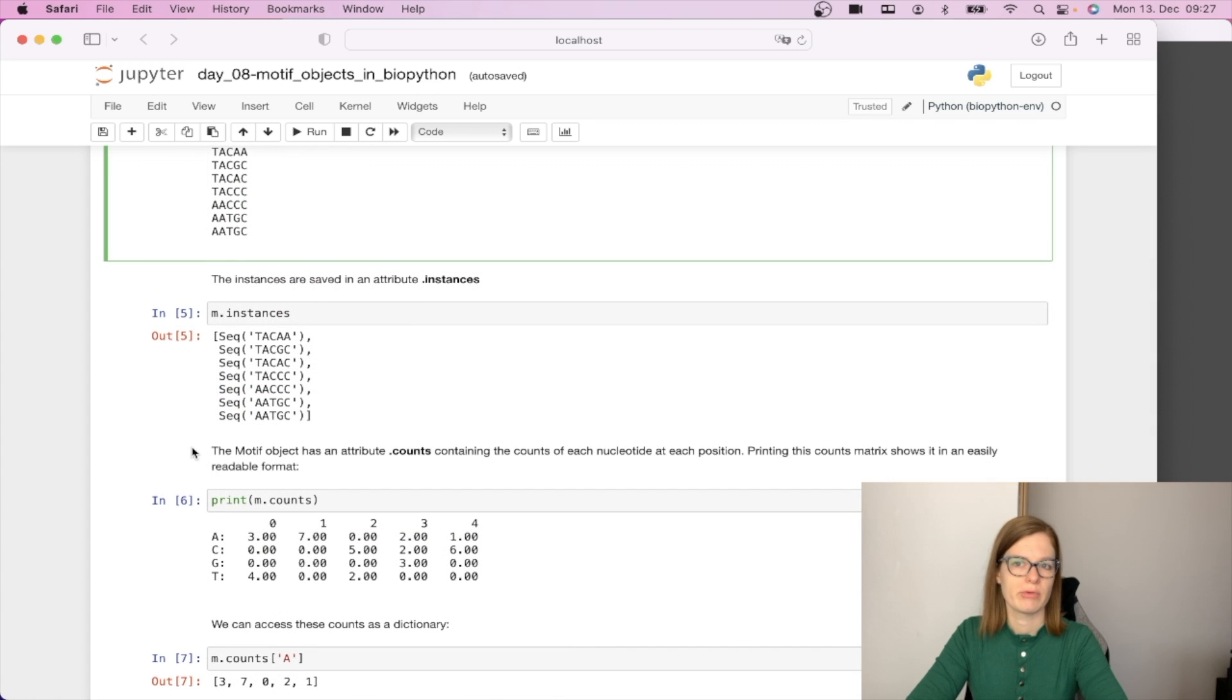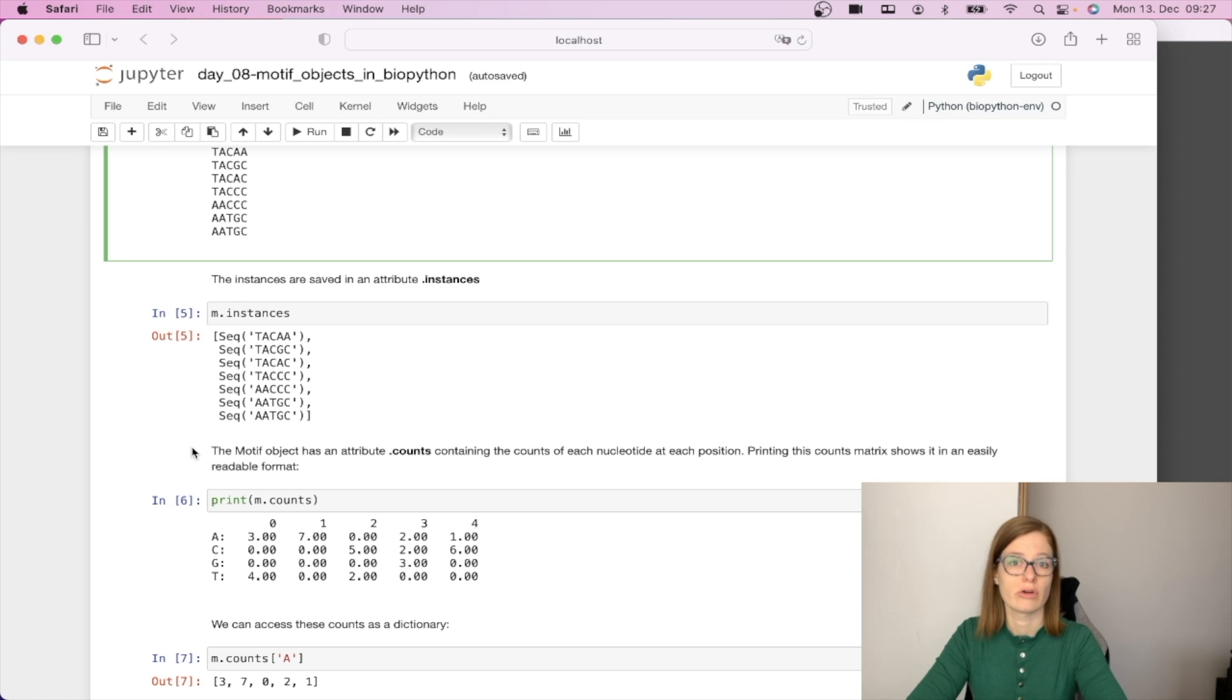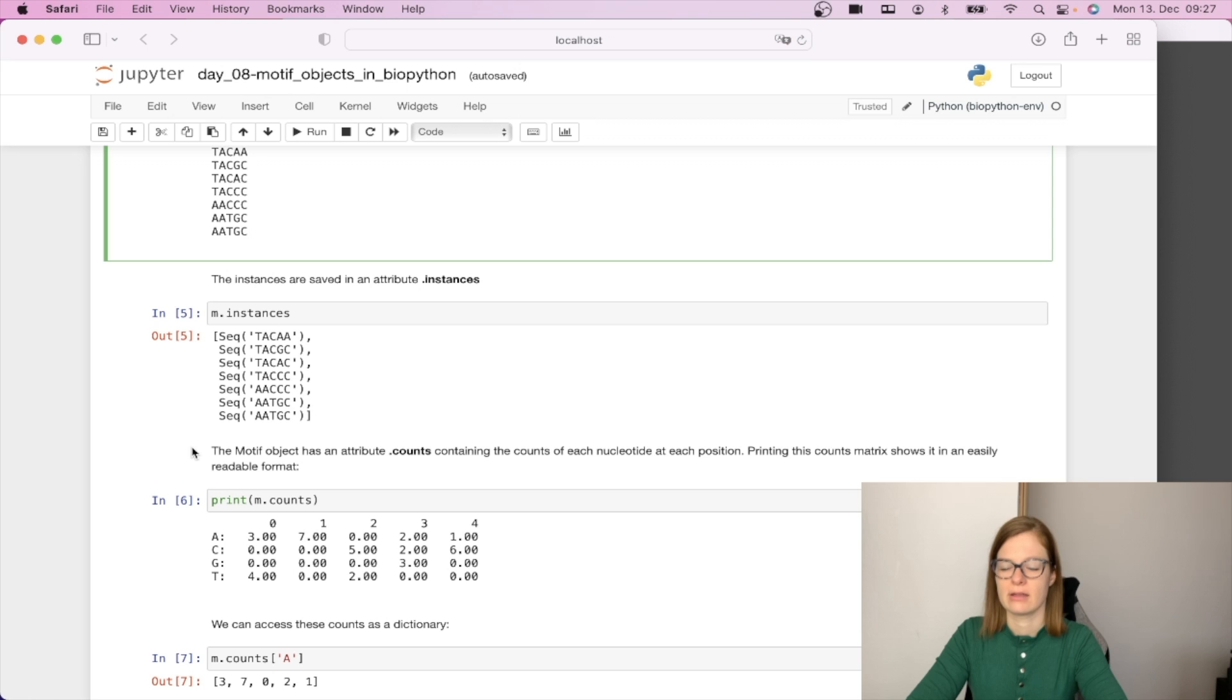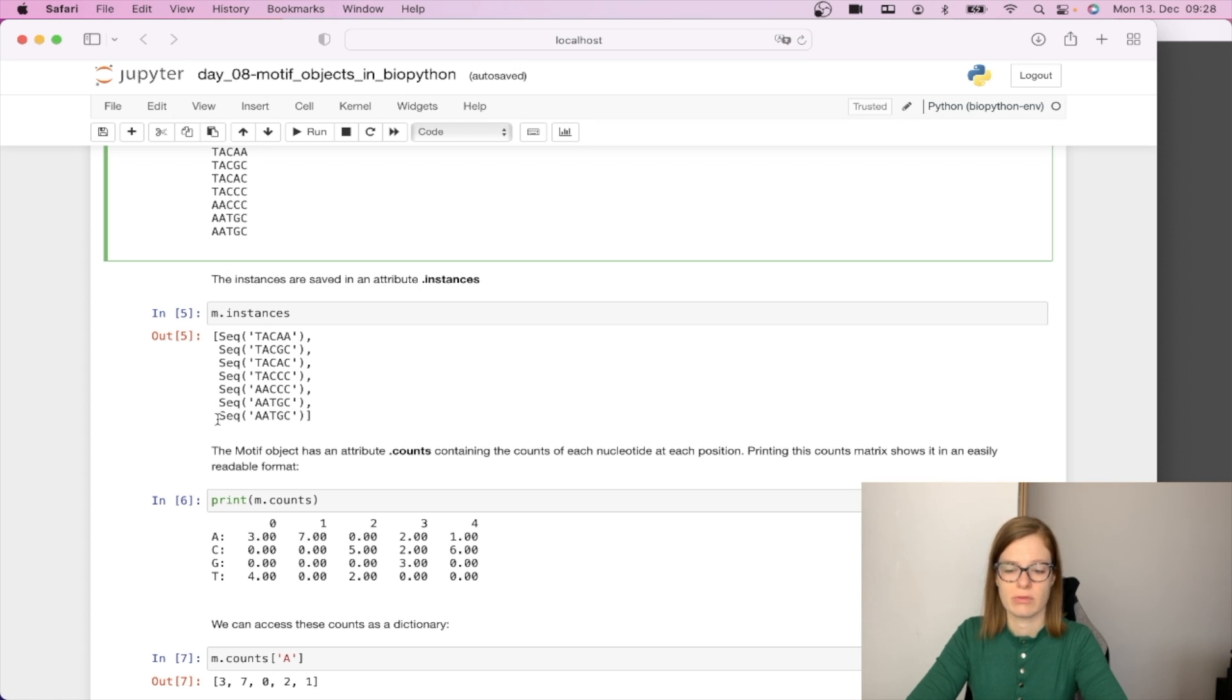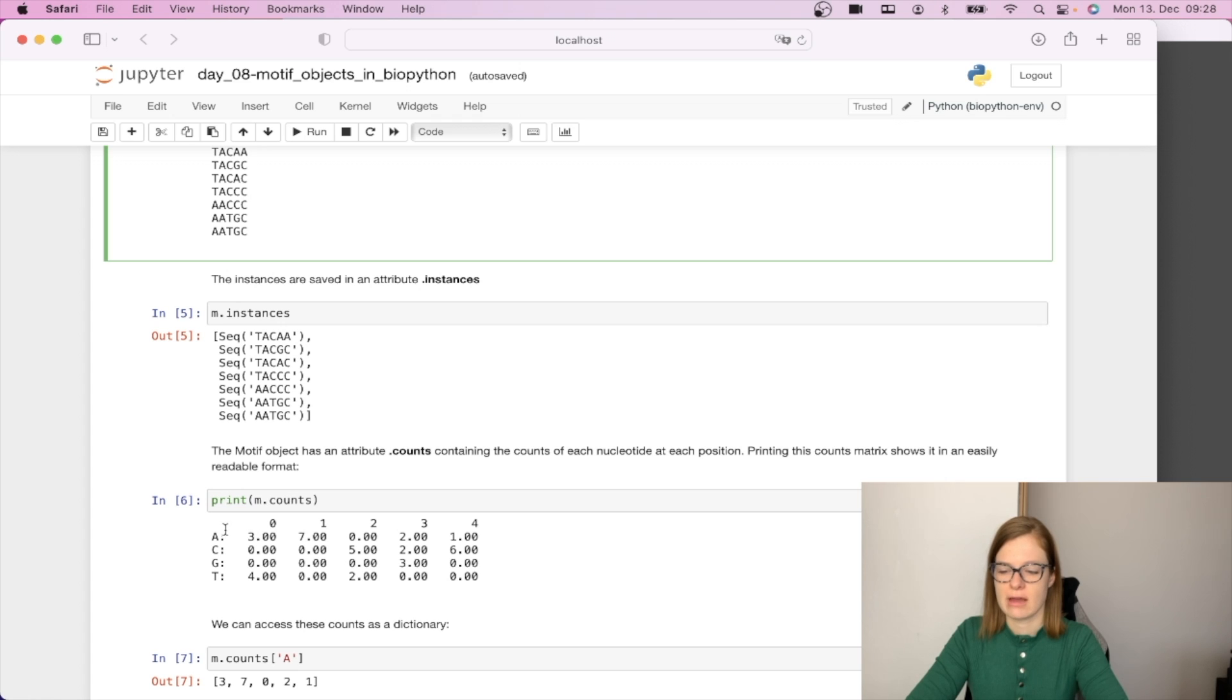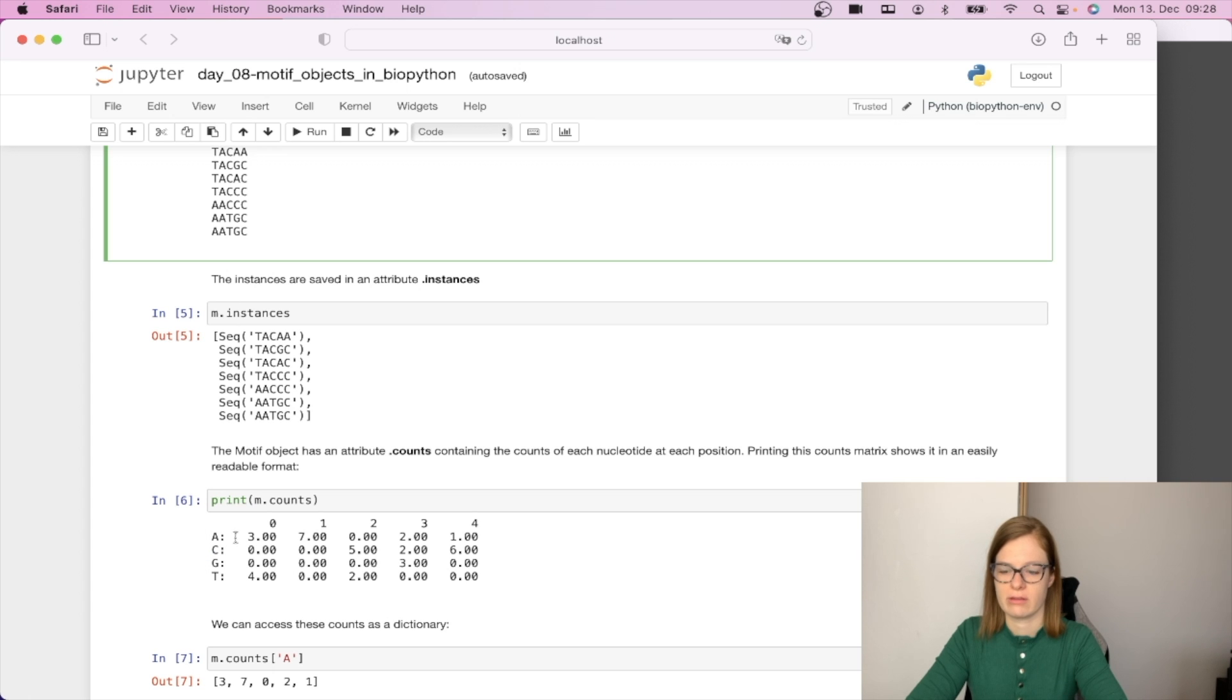In one of my previous videos we also learned how to create profile metrics or count metrics. Here motifs objects have an inbuilt functionality which gives us exactly that. The motifs object has a dot counts attribute containing counts of each nucleotide at each position. We can print this by calling print m.counts which will give us count per position per nucleotide. Just to remind ourselves what this means: nucleotide A on the first position in the sequences appeared three times.